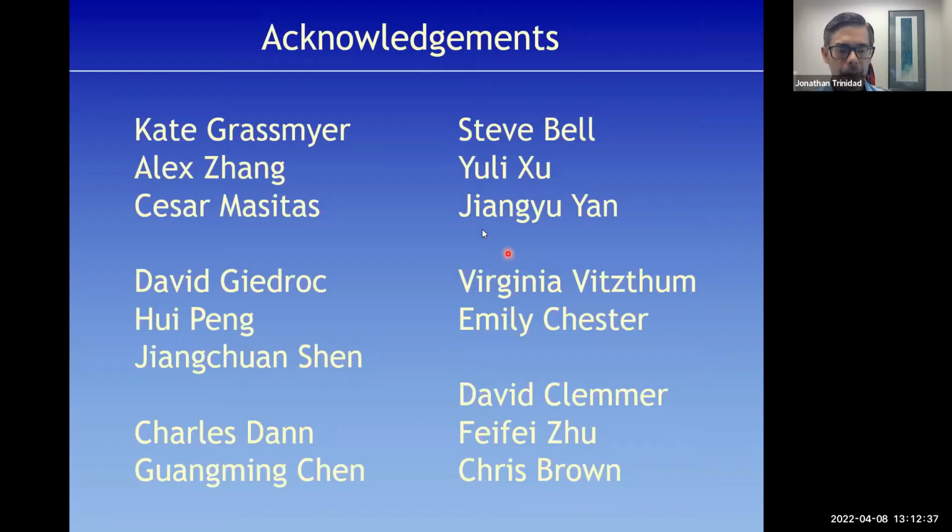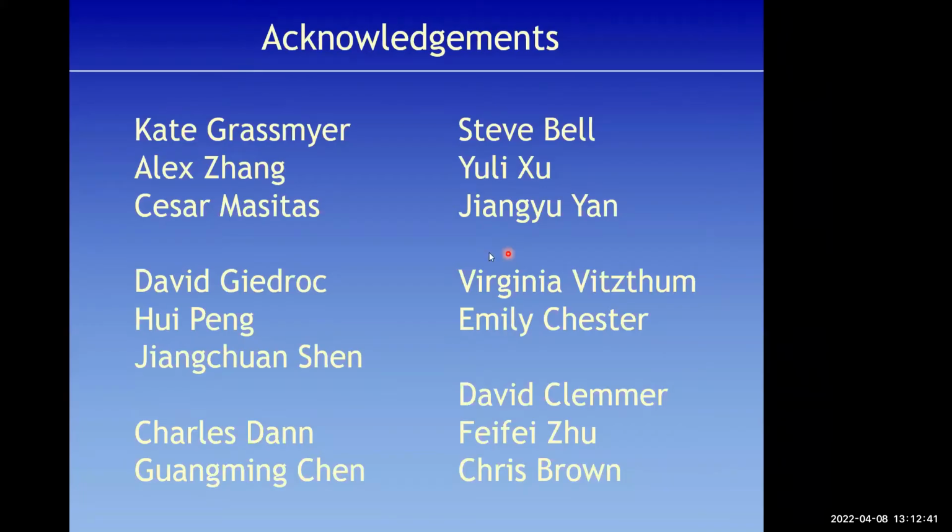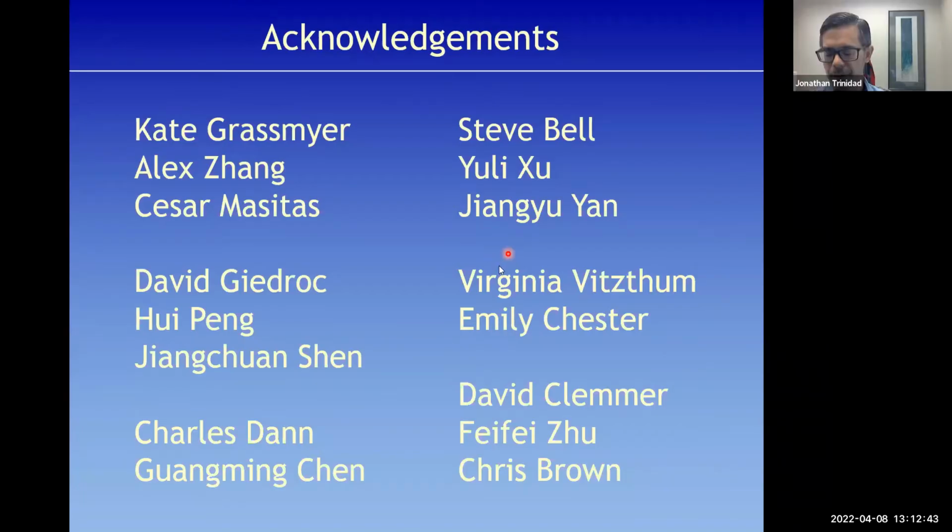All right. Did you have any follow-up? No, I think I'll think about it. Okay, but yeah, if you want to learn more about the tagged cross-linkers, you can drop me an email. All right, the next question: how to prepare detergent-resistant cell membrane proteins for MS?